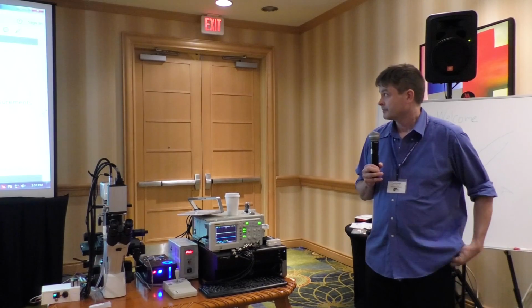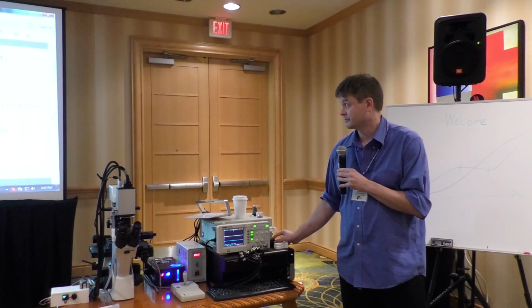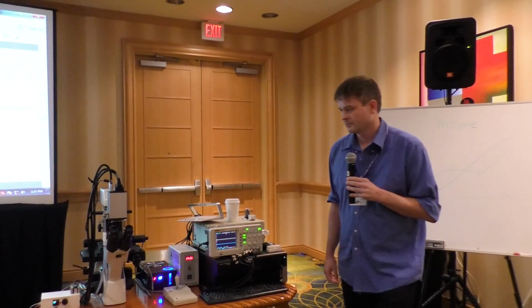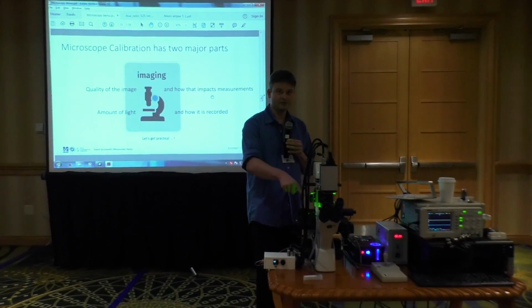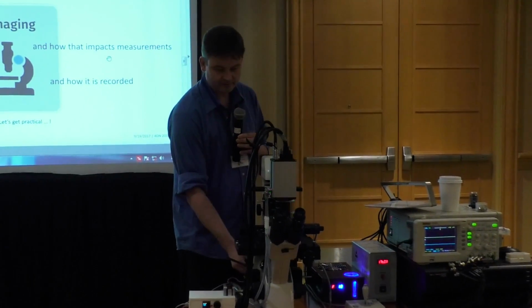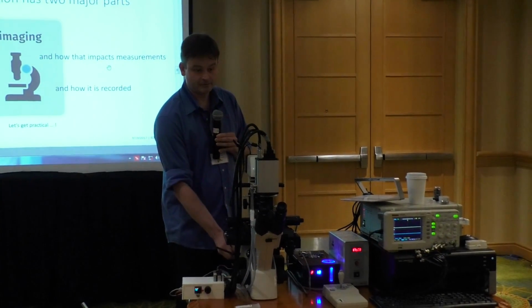But there's definitely an impact it has on our measurements. Now, the other component is that if I move this little slider back here, at least for ones in the front, you should see there's a lot of light, right? And maybe in some cases I need less light, but there's light going in.